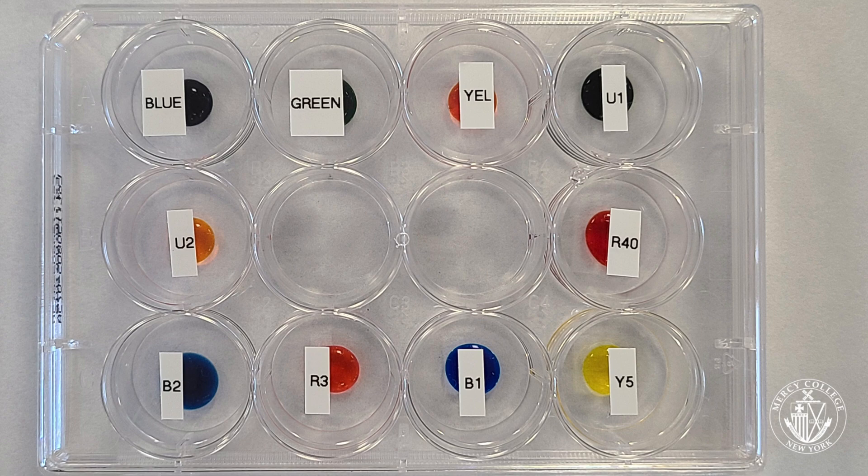Five of these are pure dye standards labeled Red 40, Blue 2, Red 3, Blue 1, and Yellow 5. The other five are potential dye mixtures drawn from blue, green, and yellow food coloring, as well as two unknowns labeled Unknown 1 and Unknown 2.